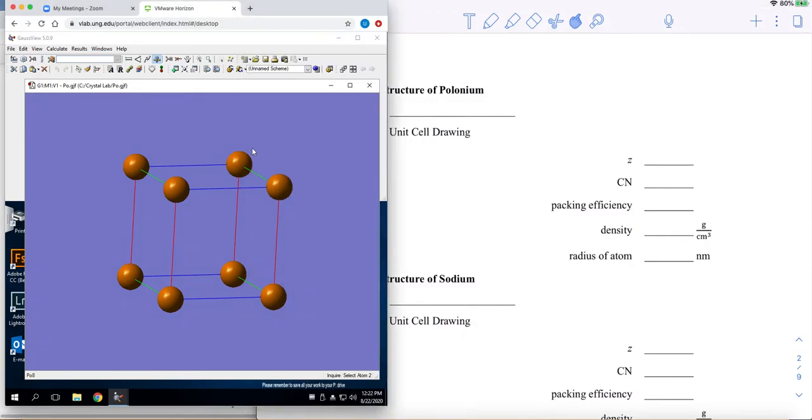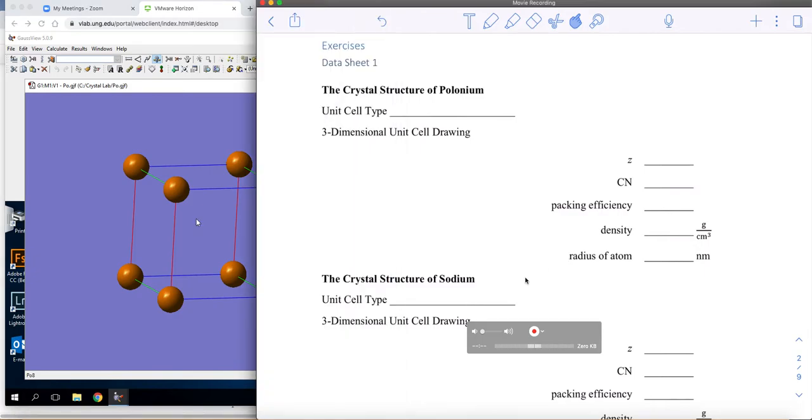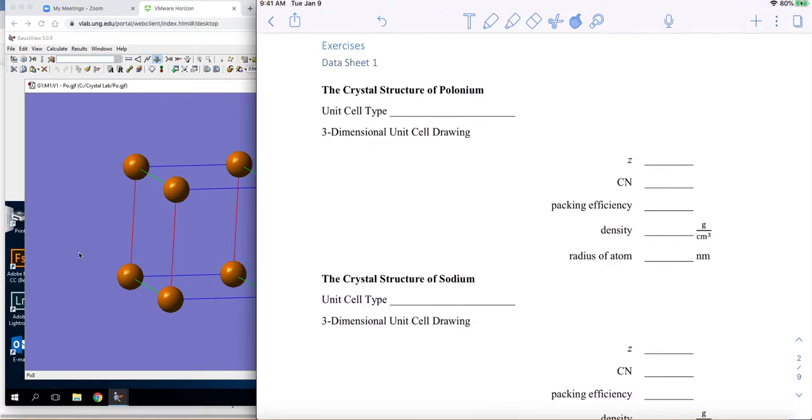So I'm going to have our actual Gaussian program that we normally use when you're here in person to show you the structure types. We'll talk a little bit about what the structure types are and help you identify what you're looking at, and go through the different pieces that CSE Pub is going to be looking for. Really, what you're going to see in your actual post-lab assignments is that all of these lines here are separate individual questions on CSE Pub.